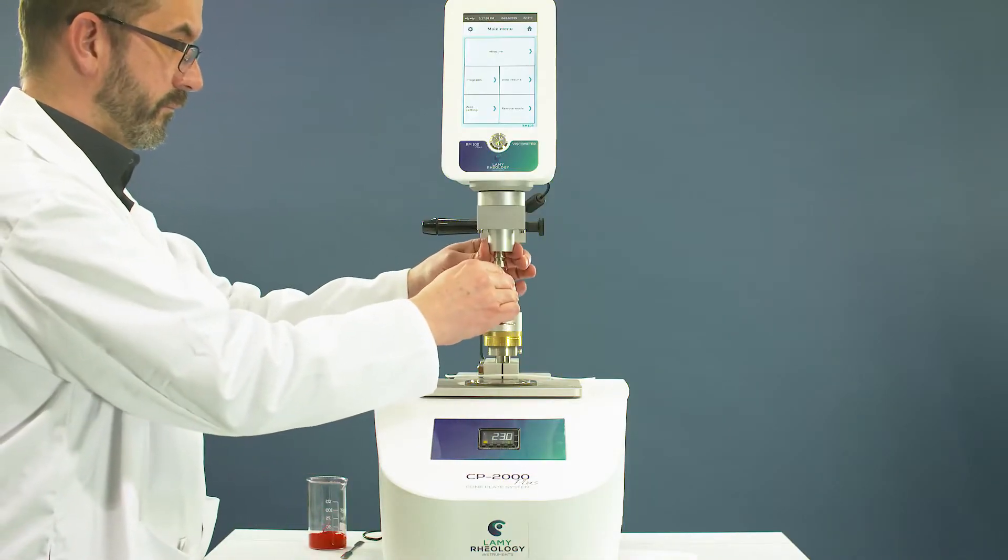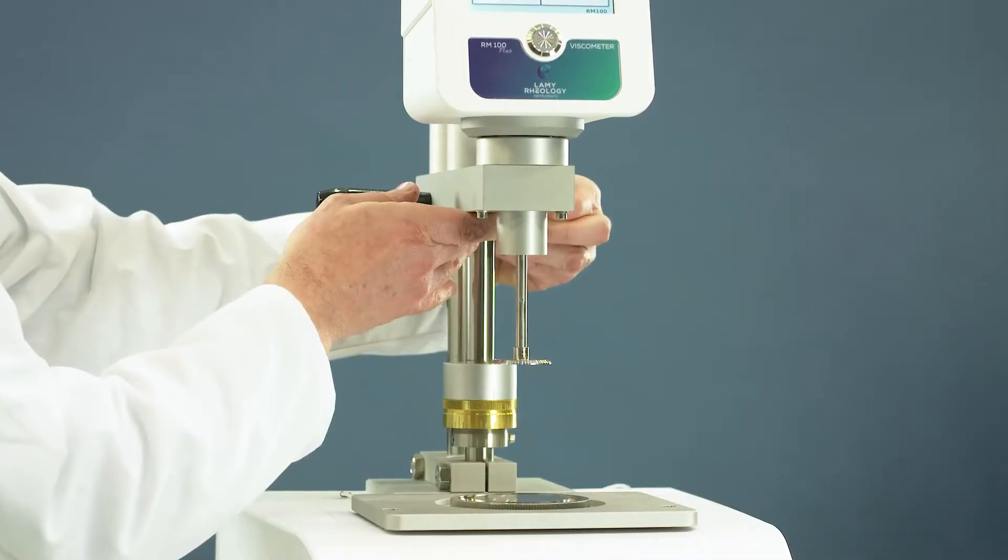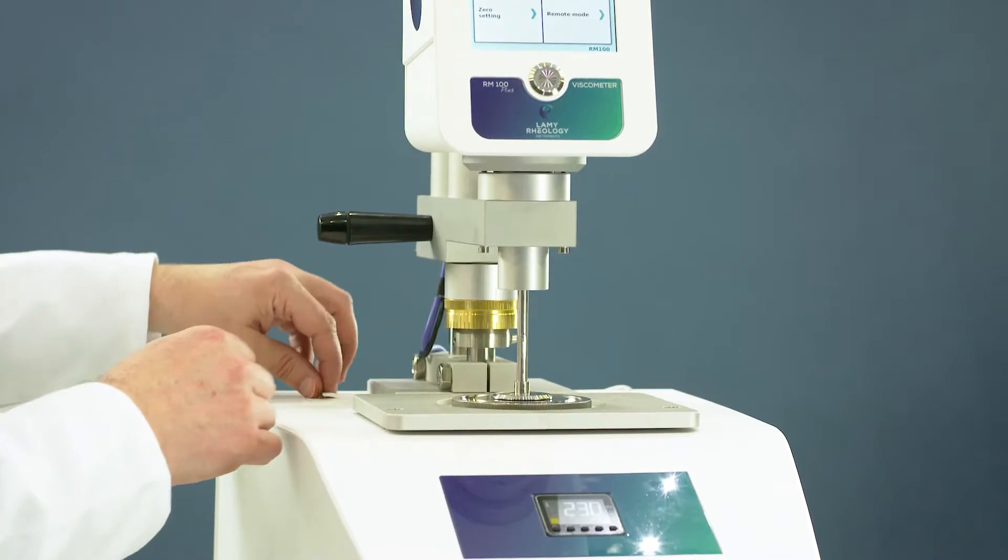Install the cone plate with the easy coupling AC265. Move down the measuring head. Be sure that the cone plate doesn't touch the lower plate.